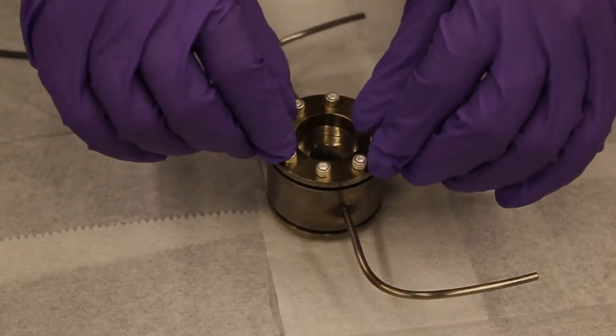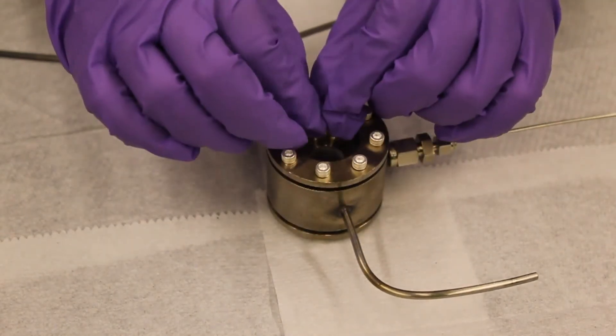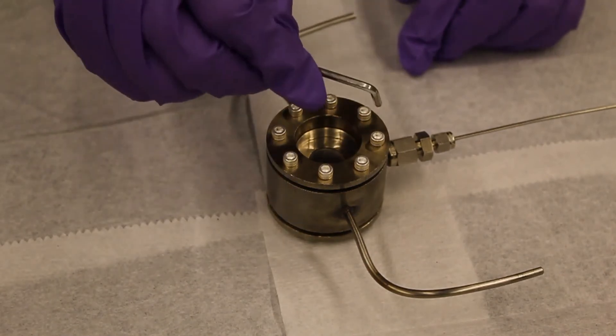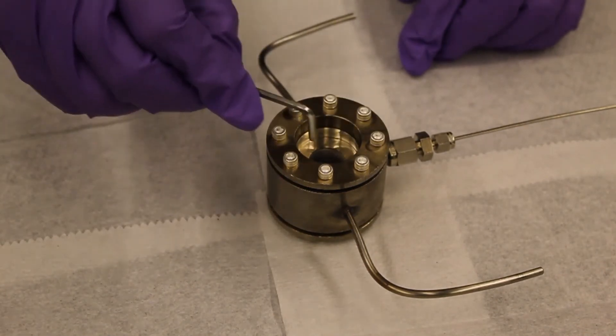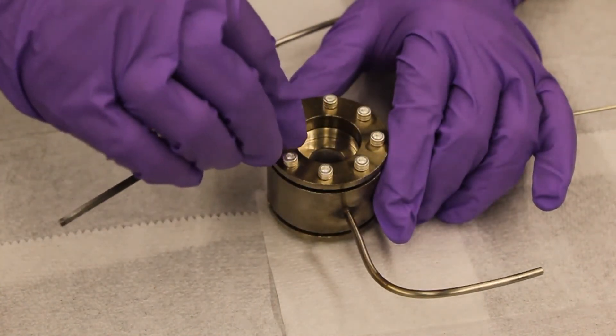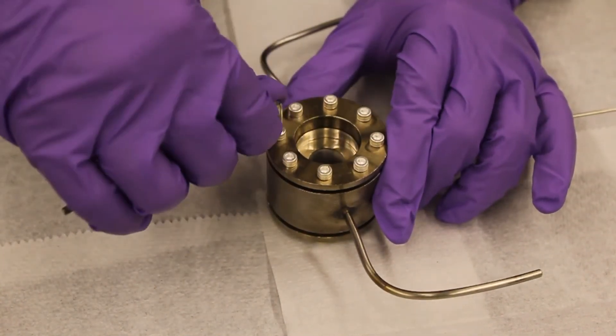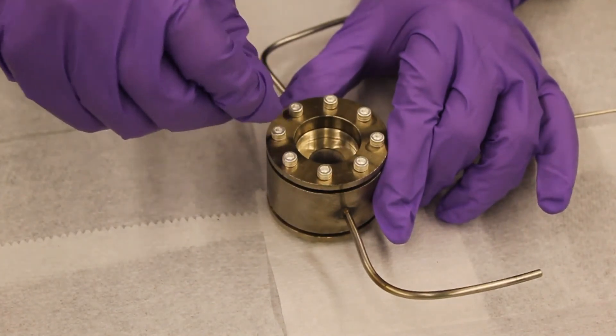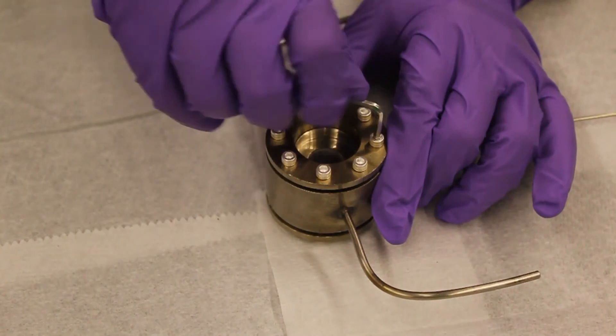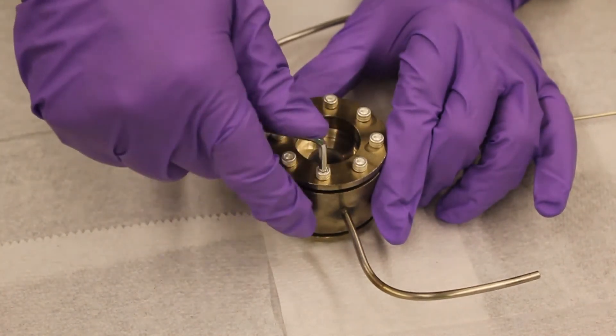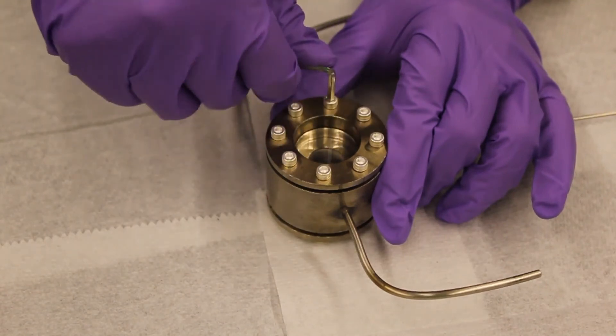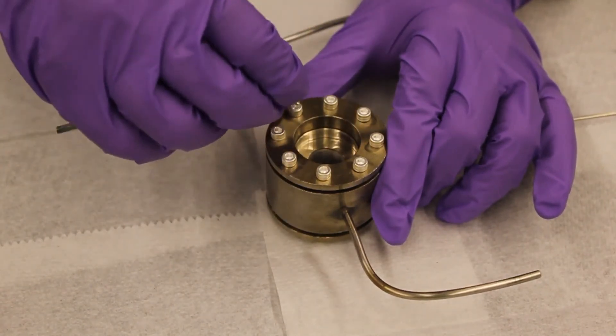To keep everything aligned, first we make sure all screws are finger tight. Next, we use the Allen wrench to tighten the eight screws sequentially. We suggest tightening the opposite screws a quarter turn at each time until the ferrule backer sits snugly. After each round of tightening, you should wait for the graphite to relax before the next round of tightening.